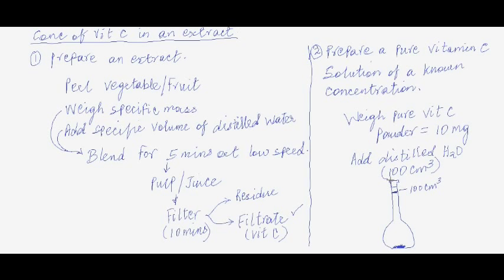and then you shake it gently till all the vitamin C dissolves into this. So there shouldn't be any vitamin C at the bottom. There shouldn't be a residue left there, or a precipitate, or whatever. Now, that gives you a vitamin C solution of a known concentration.